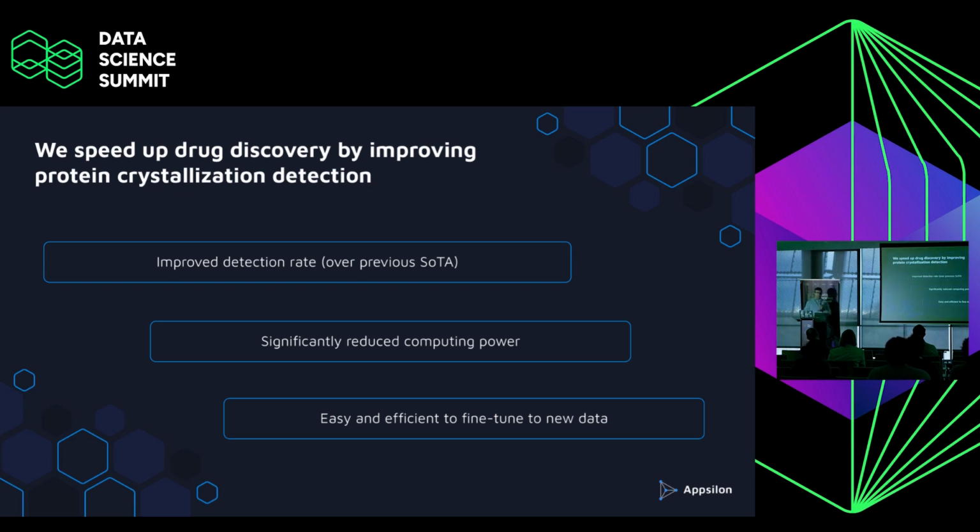What will I tell you about today? Basically, I will tell you how we've contributed to speeding up drug discovery by improving the way protein crystals are detected. And in particular, here are the key takeaways that we will take away from this presentation.